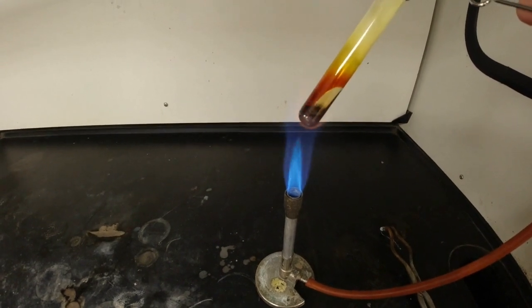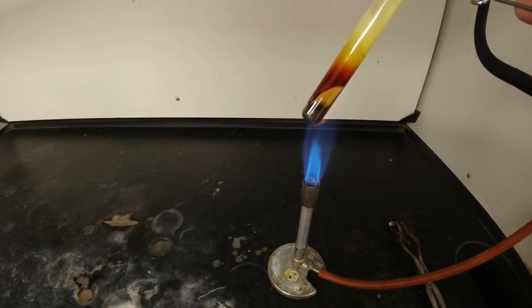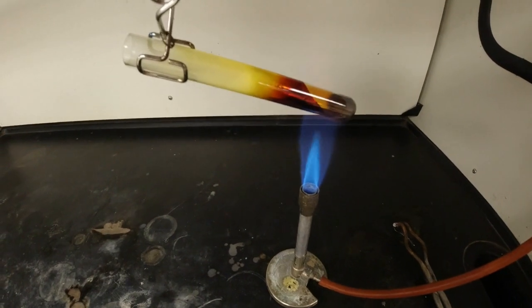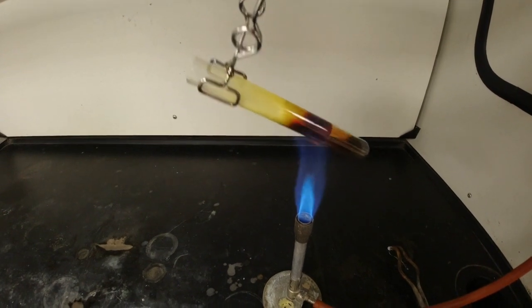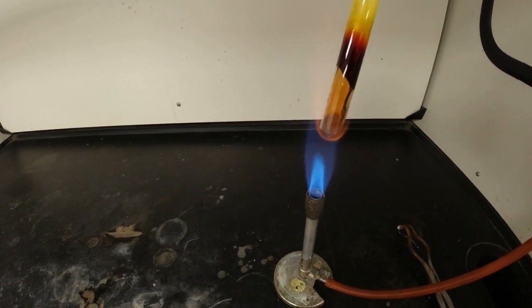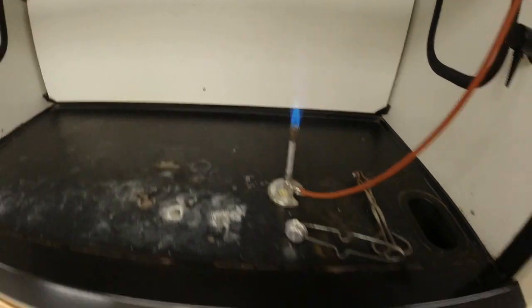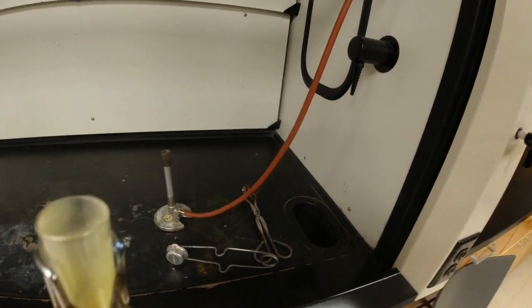If you watch closely, the yellow smoke that was on the top is getting sucked back into the solid at the bottom as it gets real hot. We're going to heat this for a minute or so. All right, that should probably do. We need to let this cool, and we'll go back up to the front.